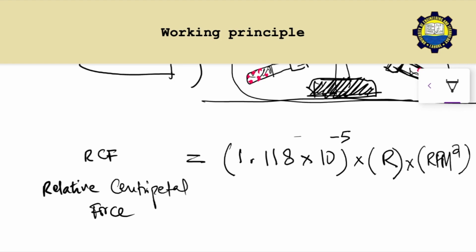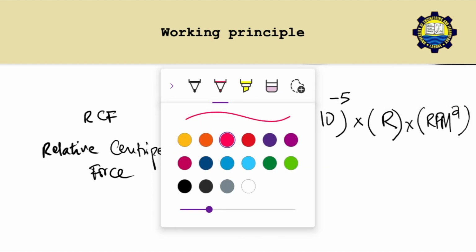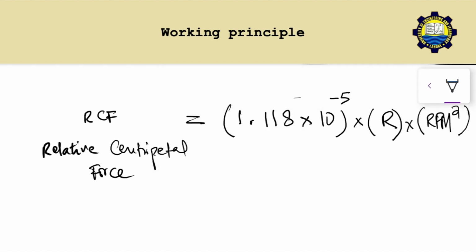Usually what we do is we use heterogeneous materials. We use a solid, and we want to separate solid from a liquid, or liquid from a gaseous mixture. So we always have a heterogeneous mixture that we put in the centrifuge.